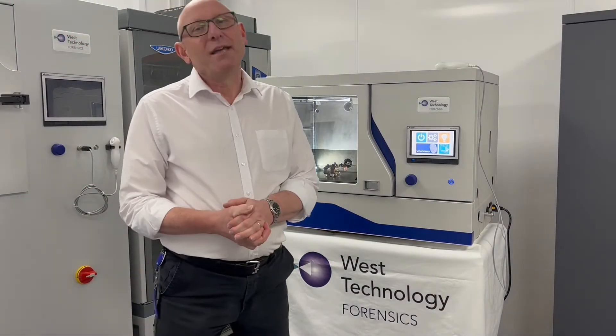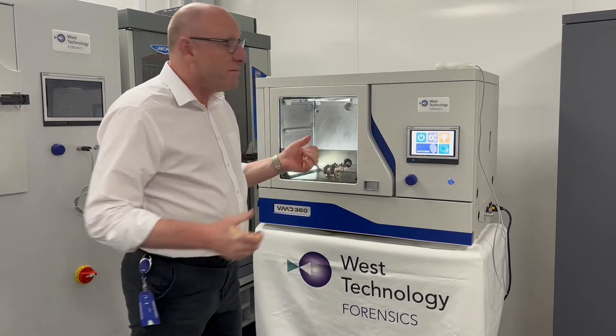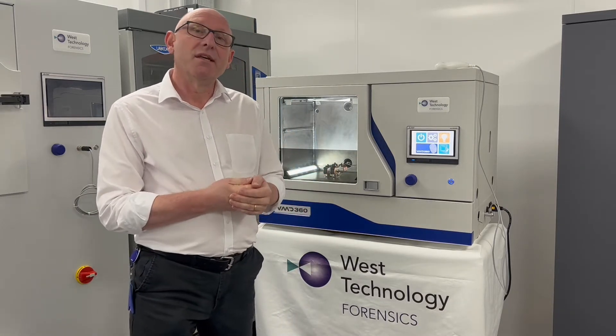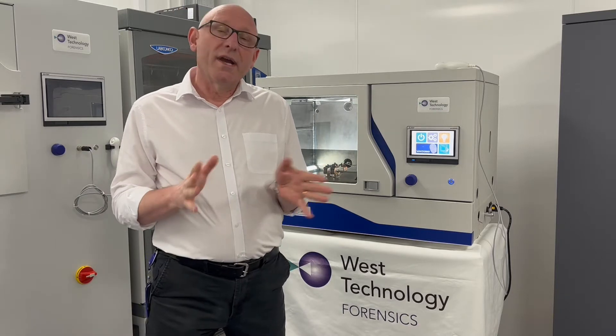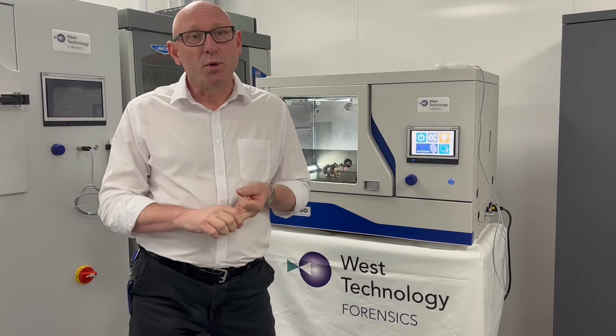Hello everybody, my name is Ian Harris and I work for West Technology Forensics. Today I'd like to introduce to you the VMD 360, which is used to develop latent fingermarks on all types of evidence ranging from porous, non-porous, or semi-porous exhibits.